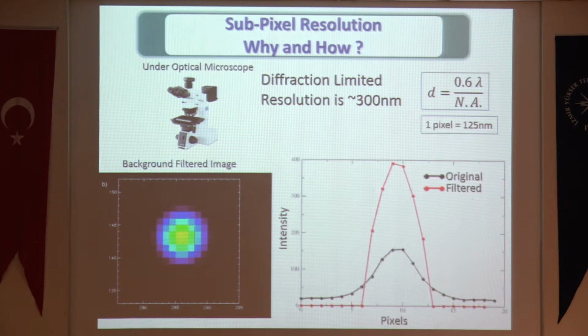If you do a line profile of the original image, an X profile along this line, the original image has a discrepancy between the background and the maximum point. This is an 8-bit image, so the maximum is like 260, but roughly here it is 150 down to maybe 20 or 30. So it's like 120 of the bit scale that you can work on.